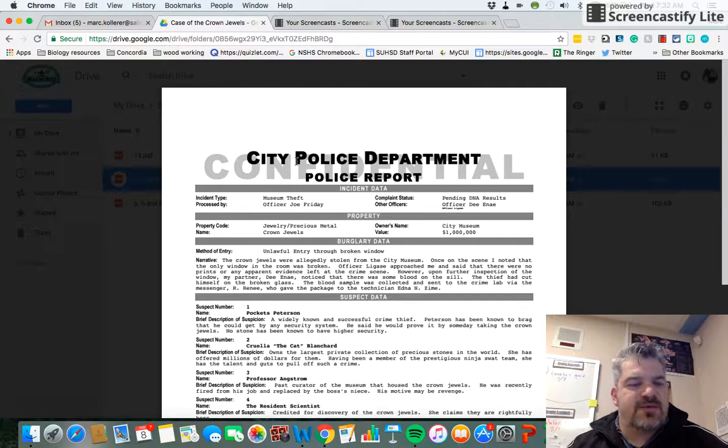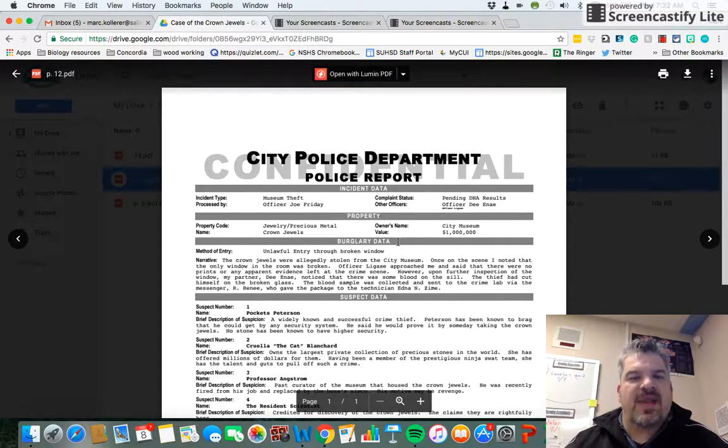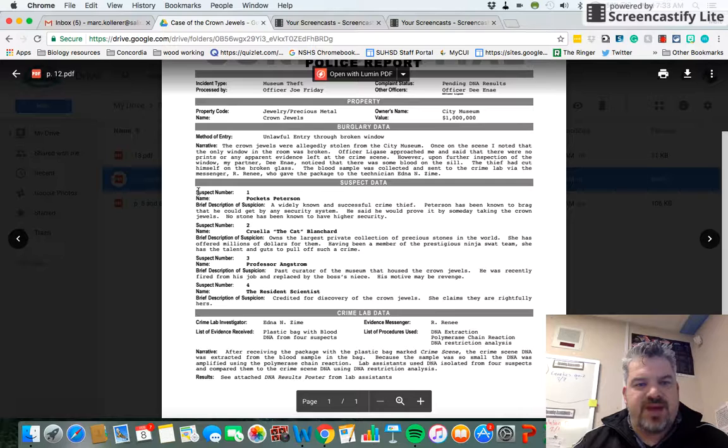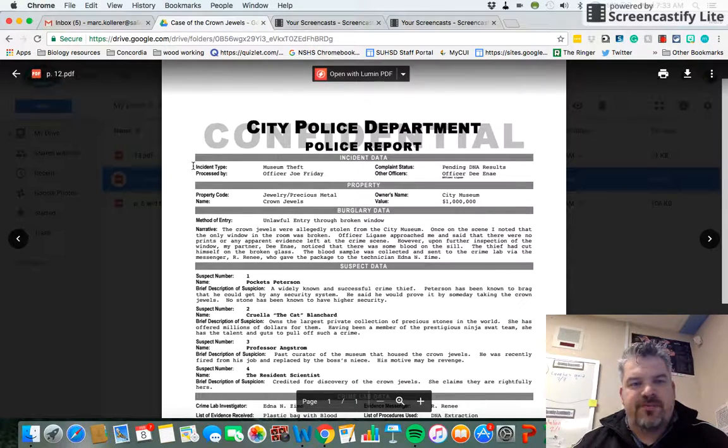Good morning. Today we're doing a simulated gel electrophoresis. I'm on campus today, but I'm not with you guys because they have me working on next year's ninth grade science curriculum. So, first thing, read this page.